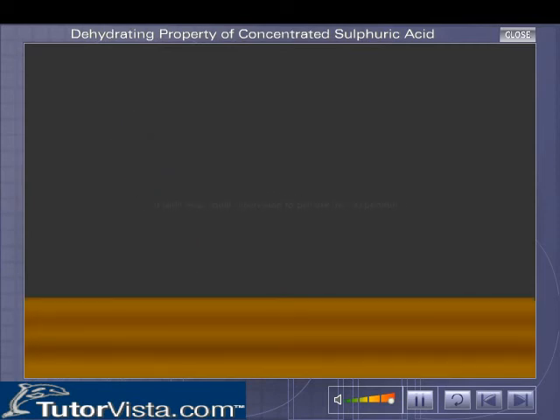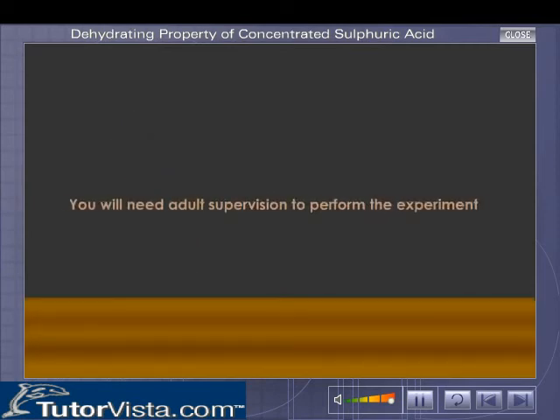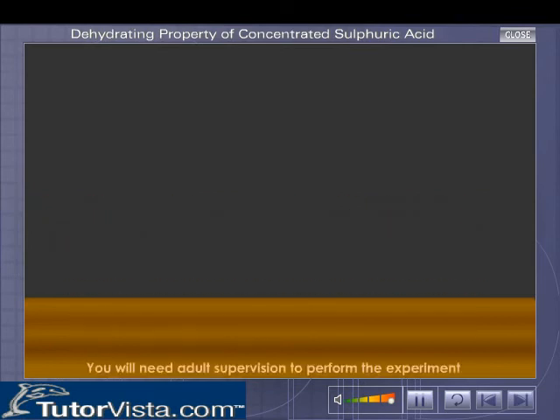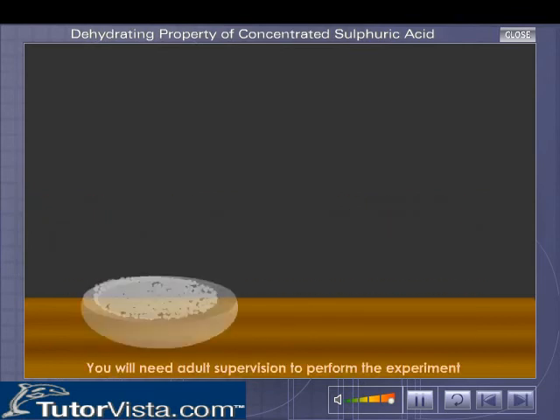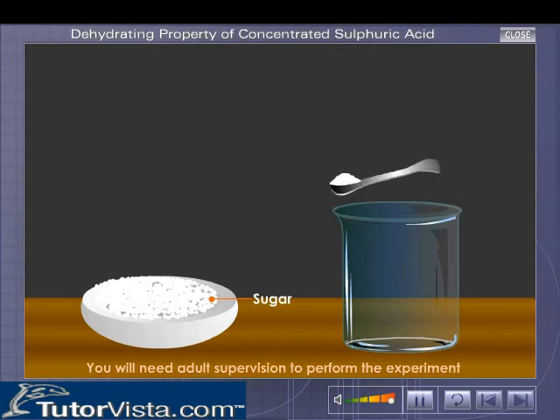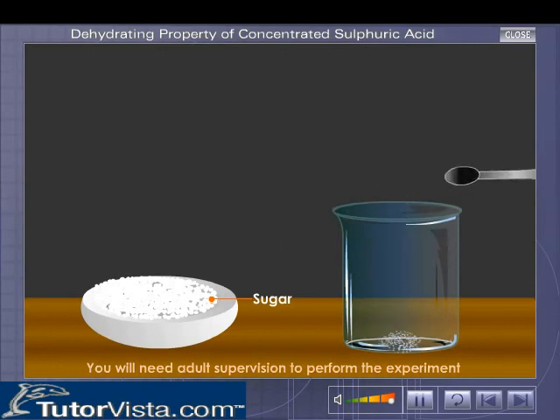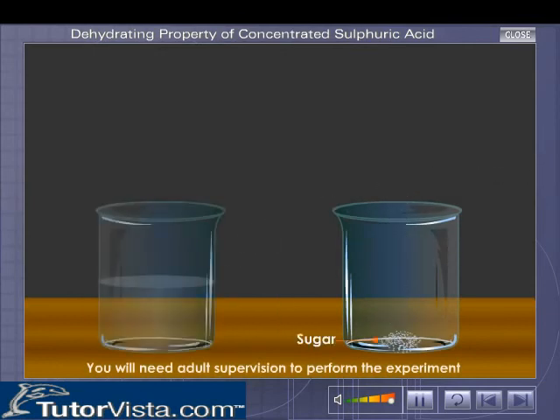You will need adult supervision to perform the experiment. Take a few spatulas full of sugar in a beaker. Add a small amount of water into the beaker.